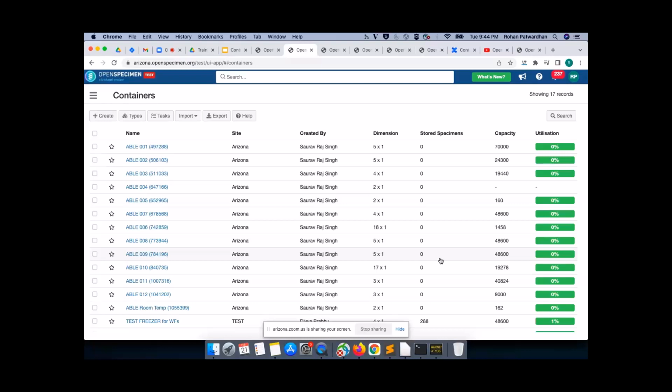The validations, specific rules and flexibility offered by the system are going to help you a lot throughout your process of learning and utilizing OpenSpecimen going forward. But coming back to one point that you made, the new utilization report is one feature that will help you achieve this kind of activity.